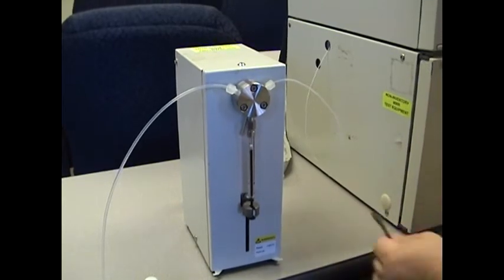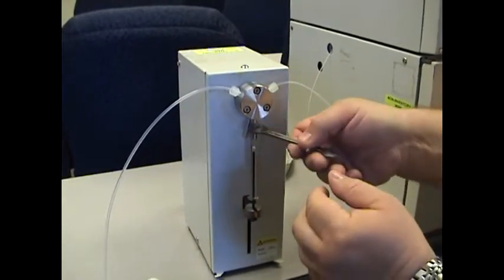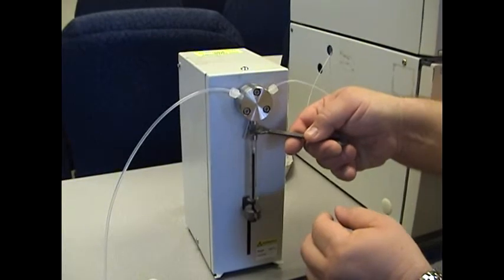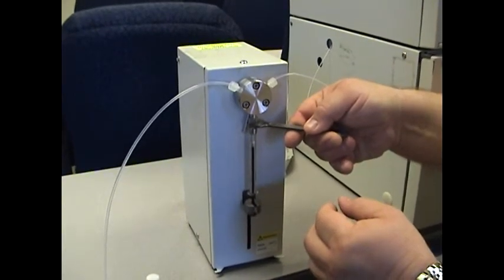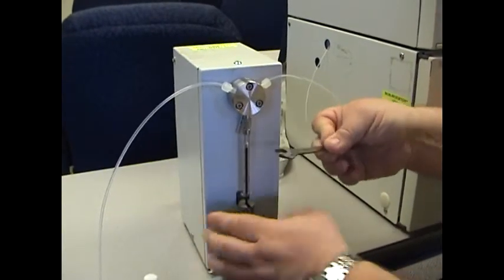Then you can tighten that same fitting into the valve body using the metric wrench. This makes it a little bit easier to get a tighter fitting to syringe connection.